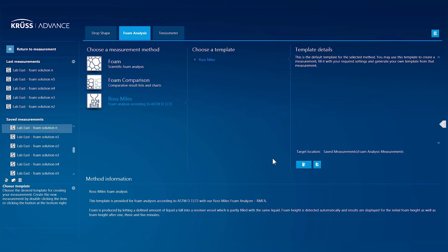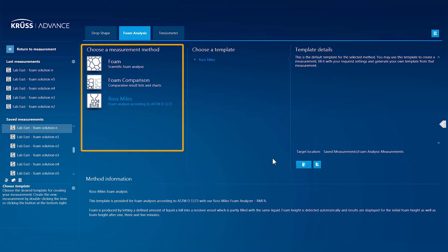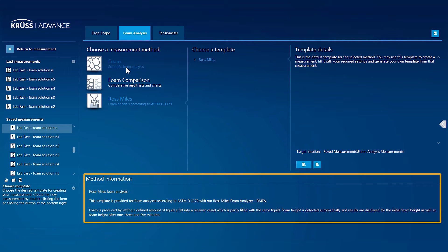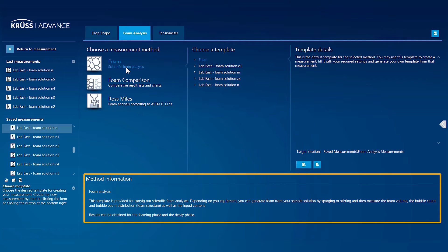From the Advance Start screen, you can choose the measurement method which reflects the type of measurement you wish to make, checking the method information text for more details.